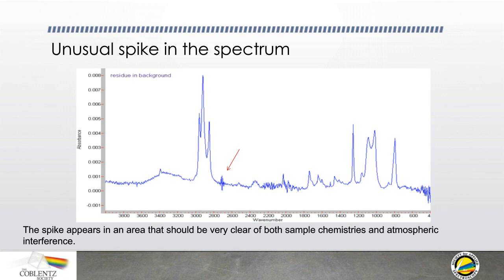Once you've done the ATR correction, you want to assess where the baseline lies, and then decide if you want to baseline correct your spectrum. And sometimes using an ATR, you will see baseline effects due to the ATR element or your sample. And actually, that's something I'm going to discuss next week.